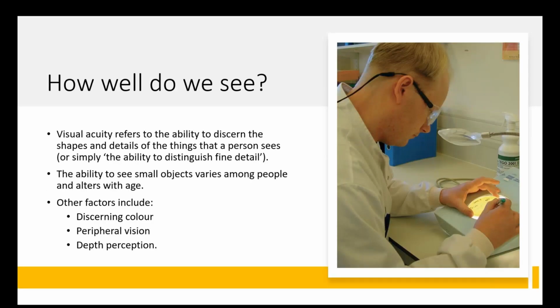There's also going to be issues about what we can actually see. So we're into the kind of concept of colonies that are there but not always visible to the naked eye, or they might be more visible to one person than another person, or there might be factors of reading that plate that affect that process.